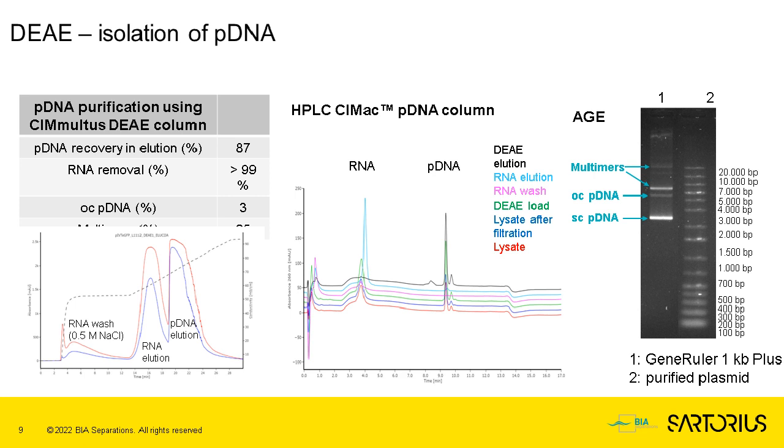We monitor this with our platform that we call PatFix HPLC platform, utilizing the CiMac pDNA column to follow the purification through.